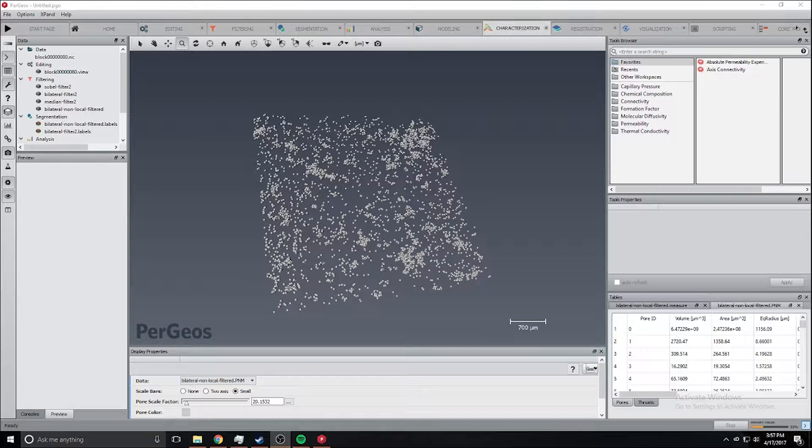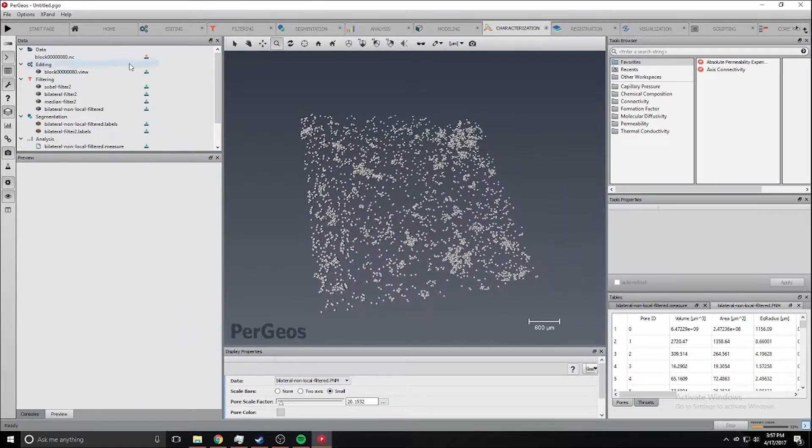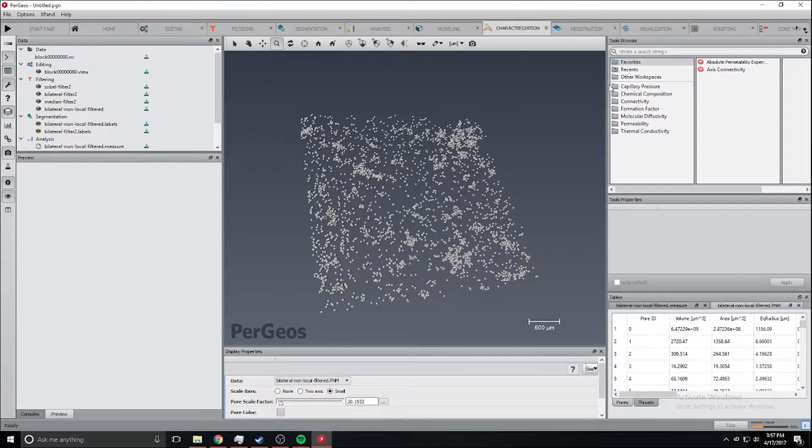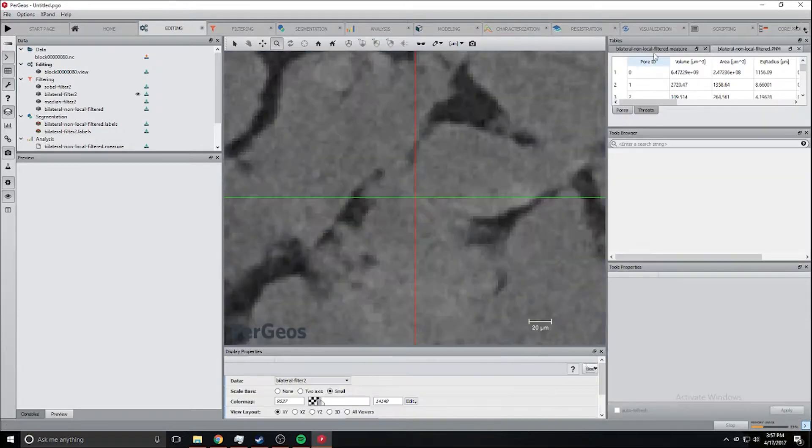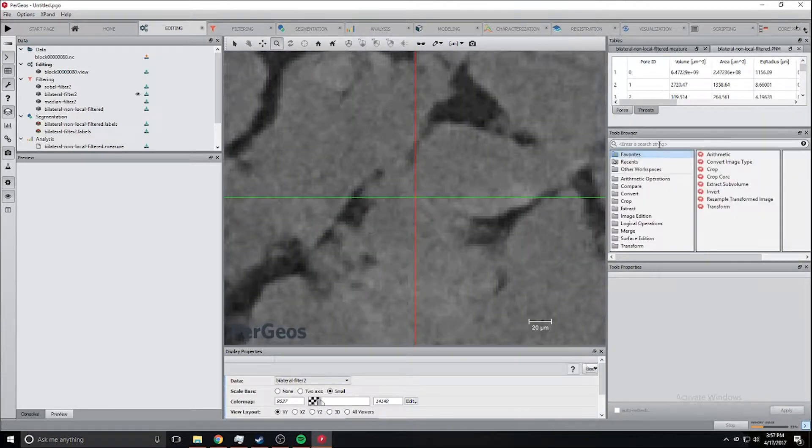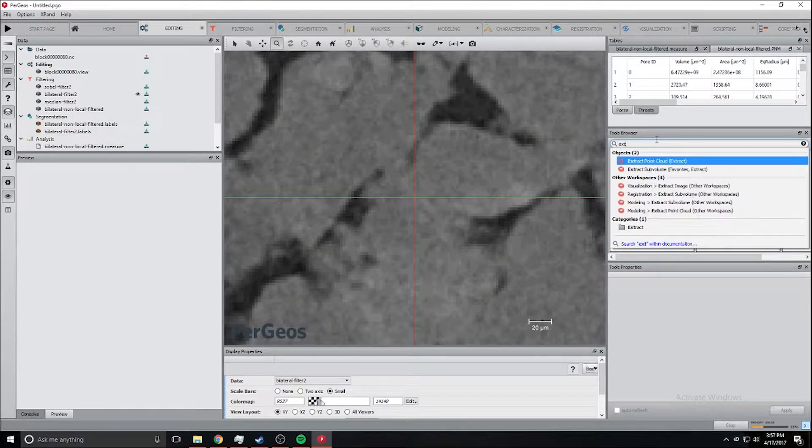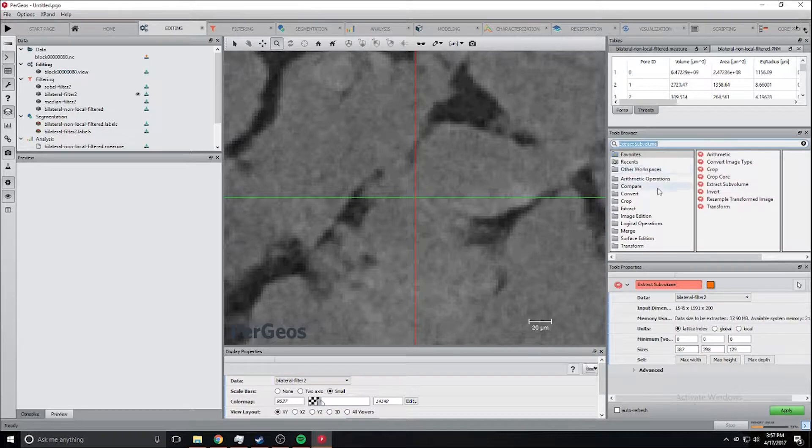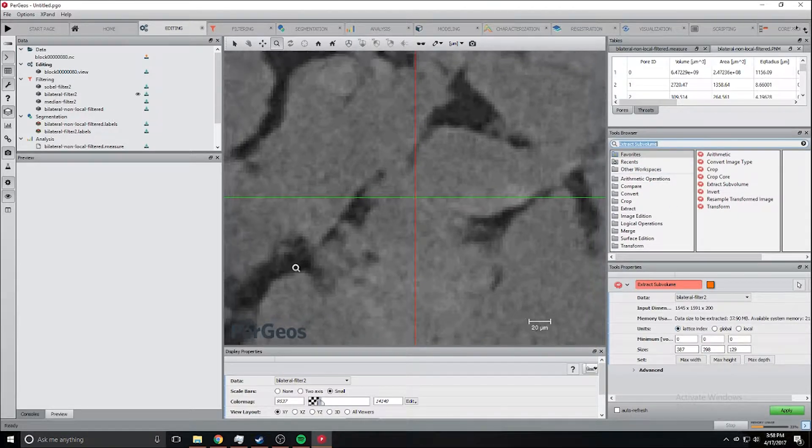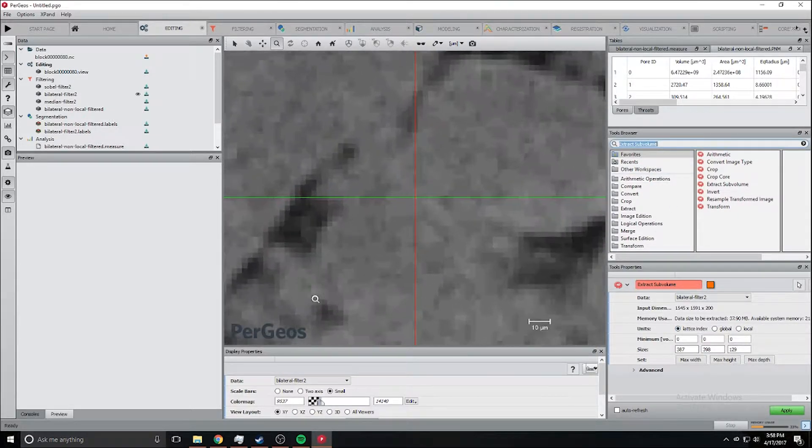To start out we need to load the dataset in. It's a really big dataset so it's hard to load the entire thing into Pergeos at once, but you can get around this by using the extract subvolume and it will extract part of it in.